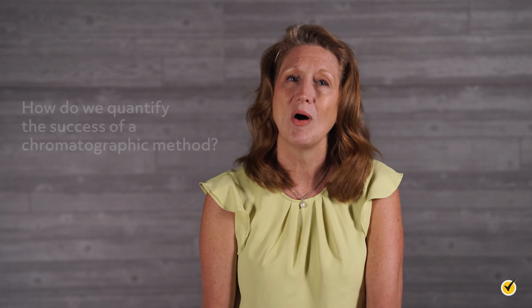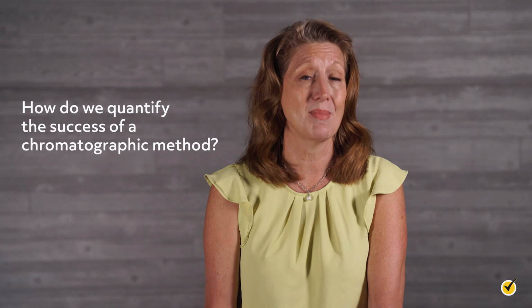Hopefully, through all this, you've picked up that while the underlying principles of chromatography are fairly straightforward, there are a lot of ways to adjust the methodology. Different stationary phases, mobile phases, temperature gradients, eluent gradients, different detectors, and on and on. Lots of research and effort is put into creating chromatography methods that successfully separate the solutes in a complex mixture. Which brings us to our final point. How do we quantify the success of a chromatographic method?